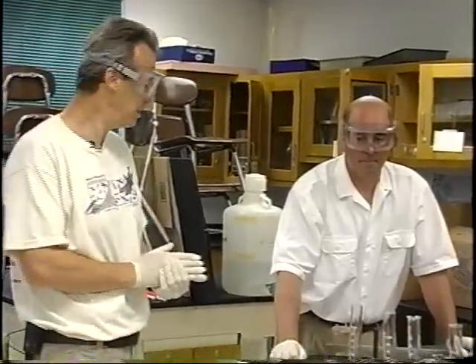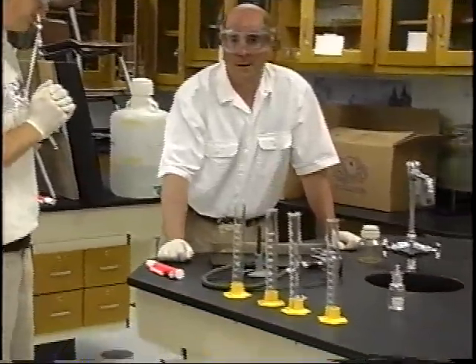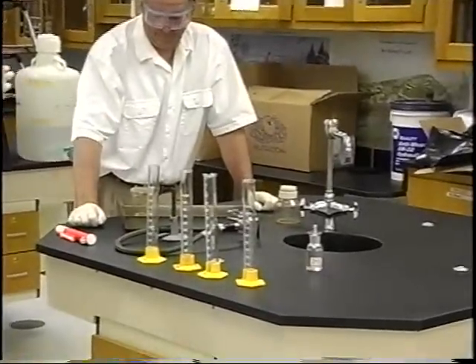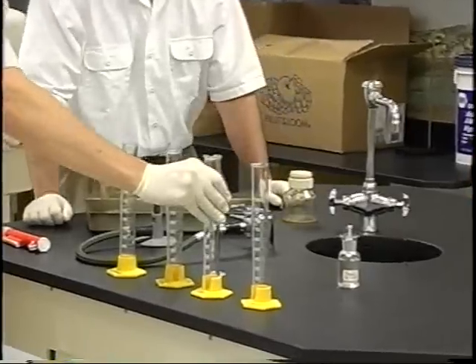All right, now we're going to show you how to prepare the water samples to run your test, like we told you before. Mr. Piskel has brought all the equipment out from the autoclave. So what's been autoclaved is the pipette, the filtration device, and these graduated cylinders. This is what we're focusing on here.